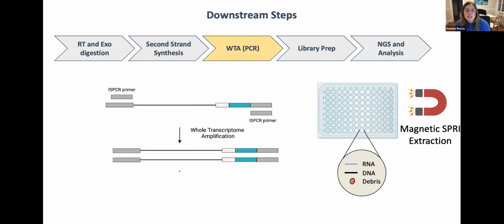amplify using PCR. And then we would isolate and clean this product using 2 rounds of SPRI purification using AMPure SPRI beads at a 0.6 and 0.8 volumetric ratio, respectively. We then quantify our product using a Qubit fluorometer to measure concentration before prepping the sequencing library.